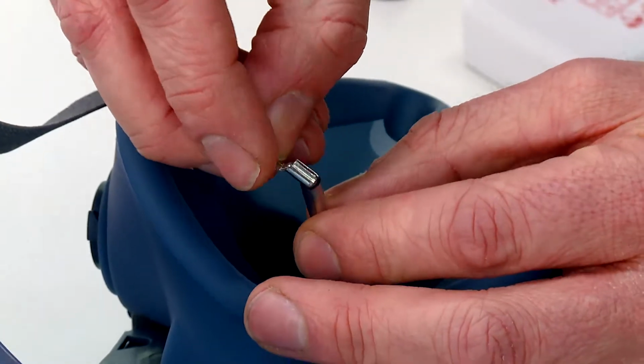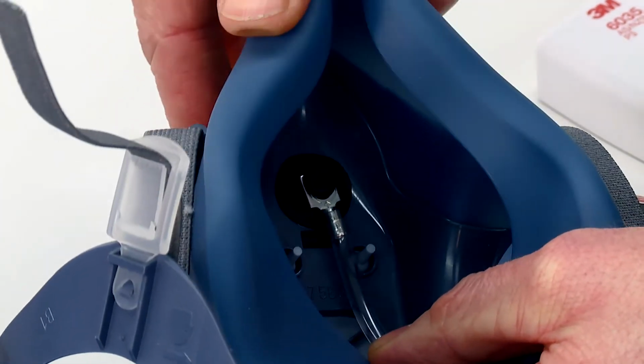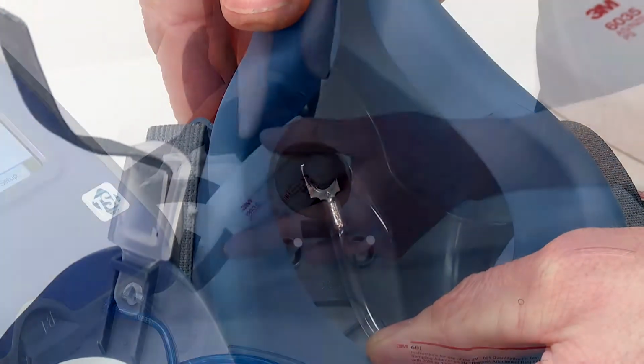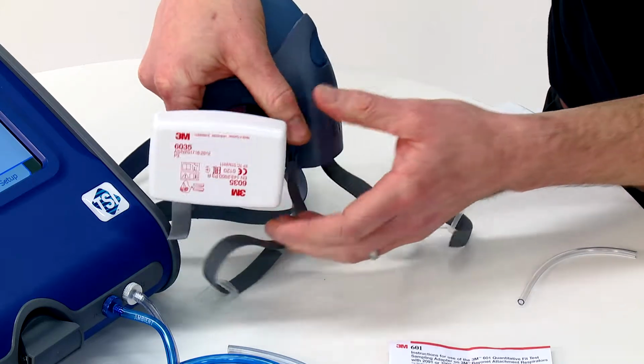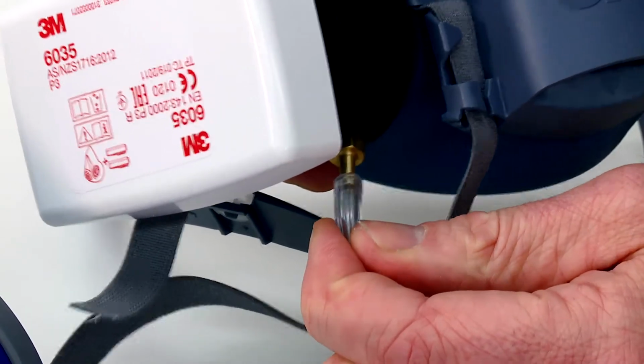Now attach the metal insert and suction cup. Secure the end of the tube to a flat surface within the mask. Connect P3 particulate filters before fitting the respirator. Connect the clear tube to the probe.